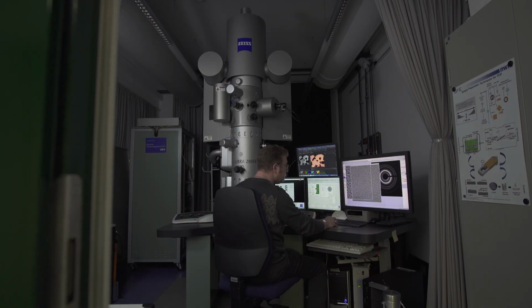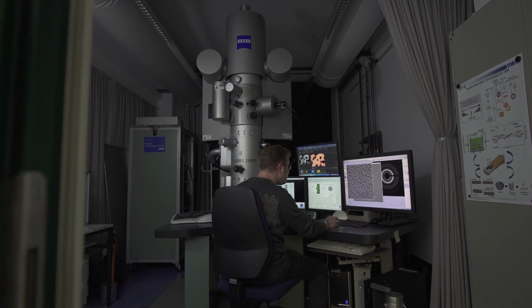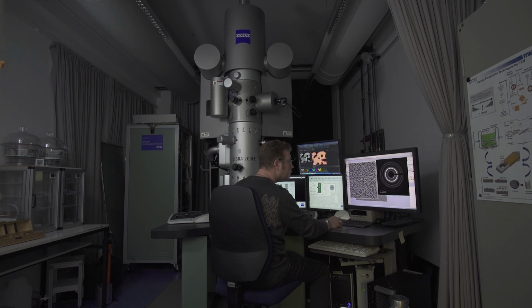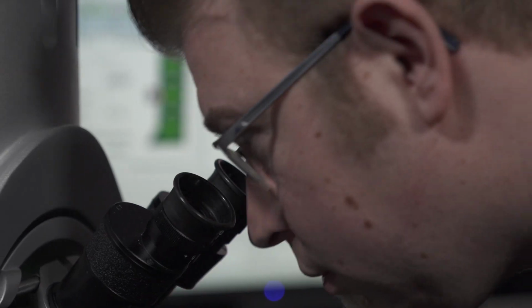We have scanning electron microscopes, where we can put in whole parts and characterize a device or characterize the internal structures. We even have a large chamber SEM, where we can put in very big things like a whole engine block. But then if we go down in the length scales, we come to the nanometer scale, maybe even to the atomic scale, and then we need transmission electron microscopes.